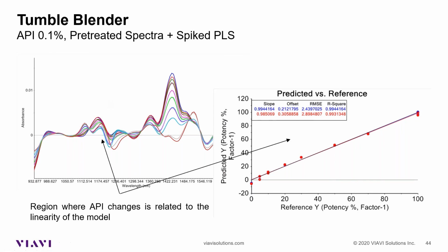The customer here was quite skeptical about the possibility of seeing such a low dosage of API. And so we tried to spike some concentrations, and we built up a PLS calibration curve. I want to clarify because I don't want to have this question later on. The PLS here is done at line, putting a small amount of sample in a beaker and mixing by hand with different API concentrations.